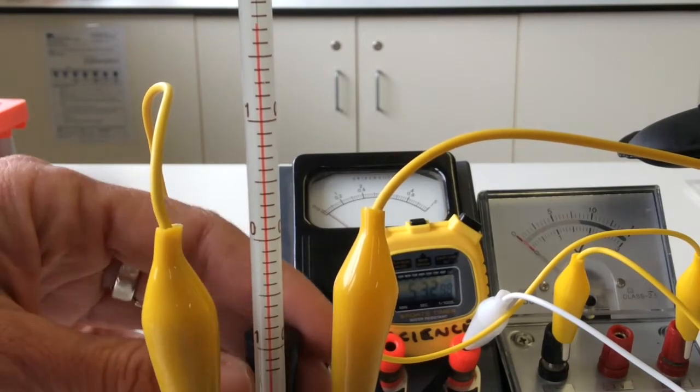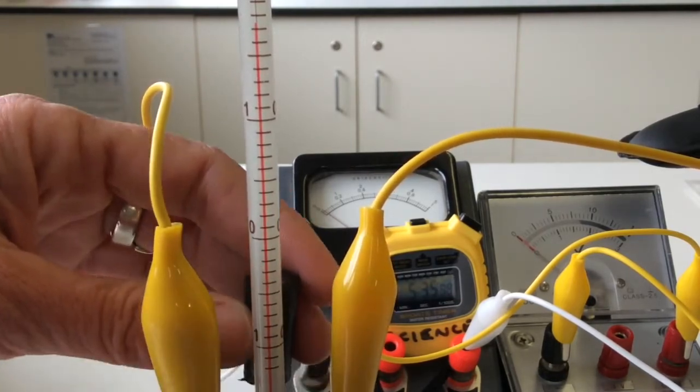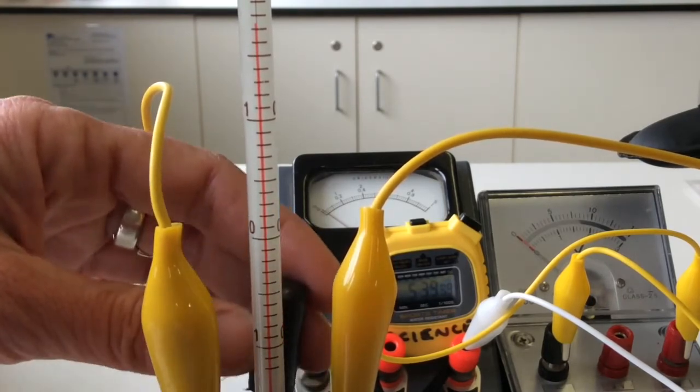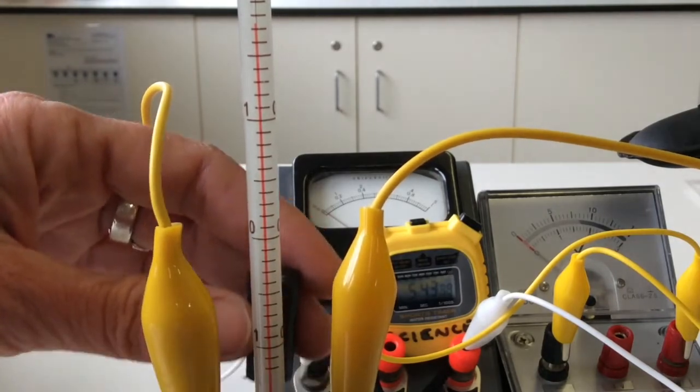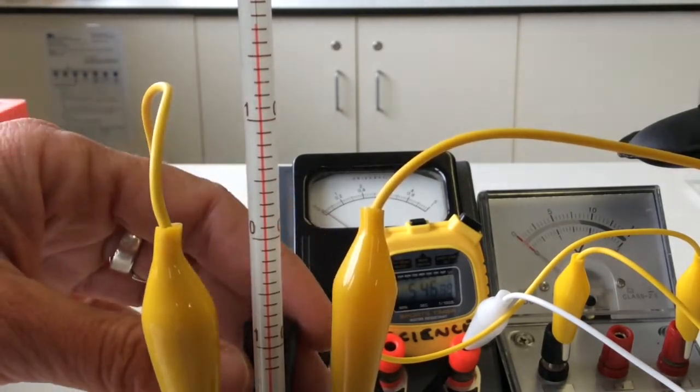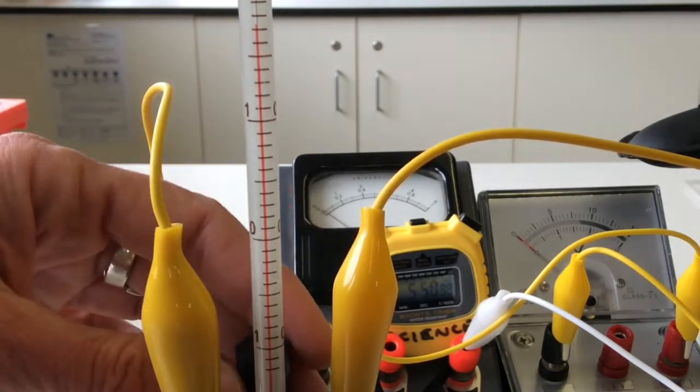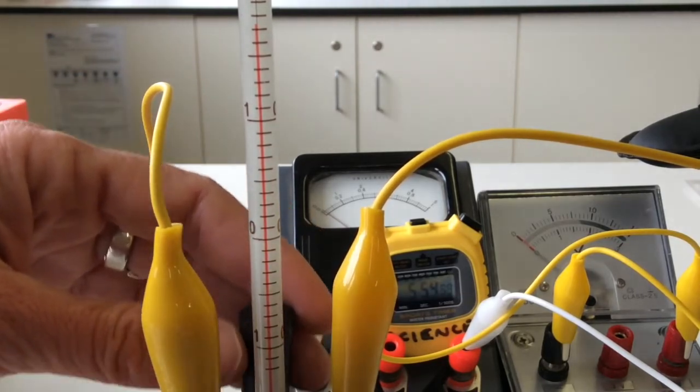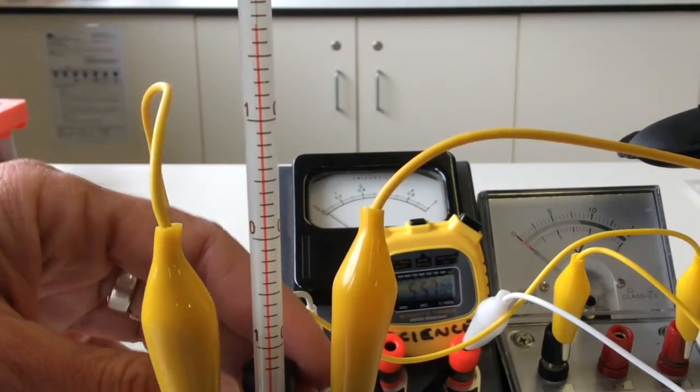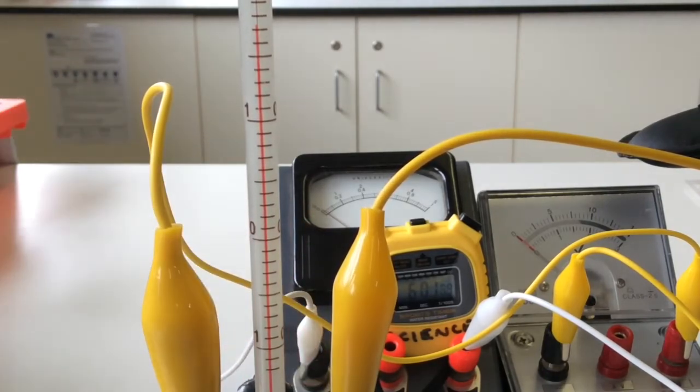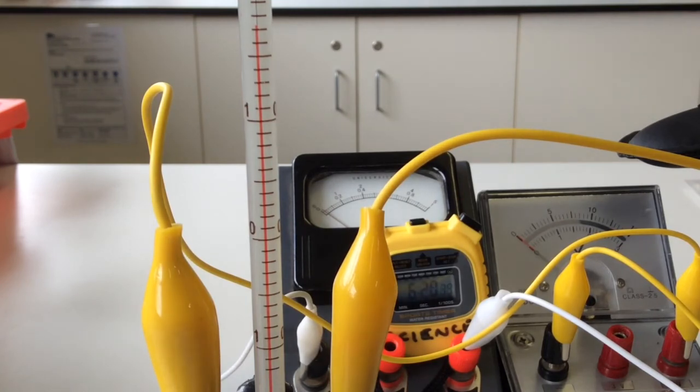30 seconds, 30 seconds gone. We've got 30 seconds left. All right, that's it, guys. I'm not going to do it twice in the experiment. It does ask for it to be done twice. Probably should do it twice with reliability, but I only want you to have to do the calculations and the graphs for one. Okay, so you'll just do that for the one, and you'll just do the calculation of the calibration factor for that first one. Then you'll finish off writing up that experiment.